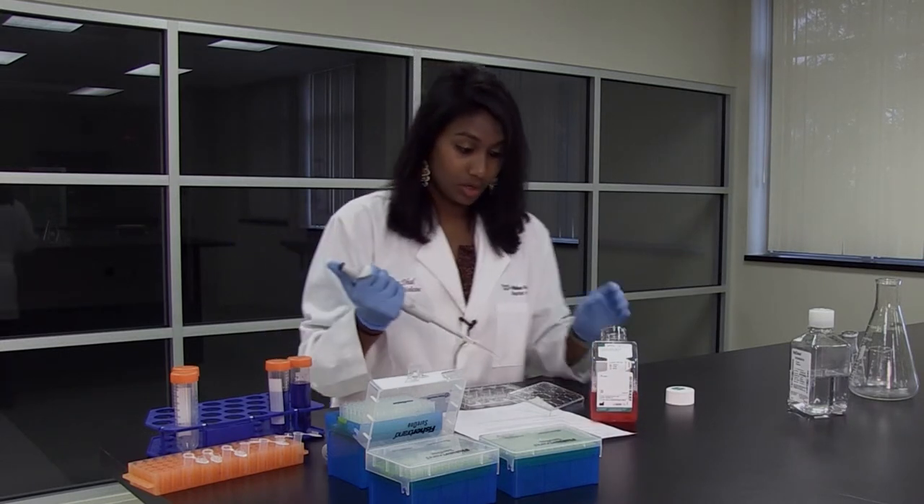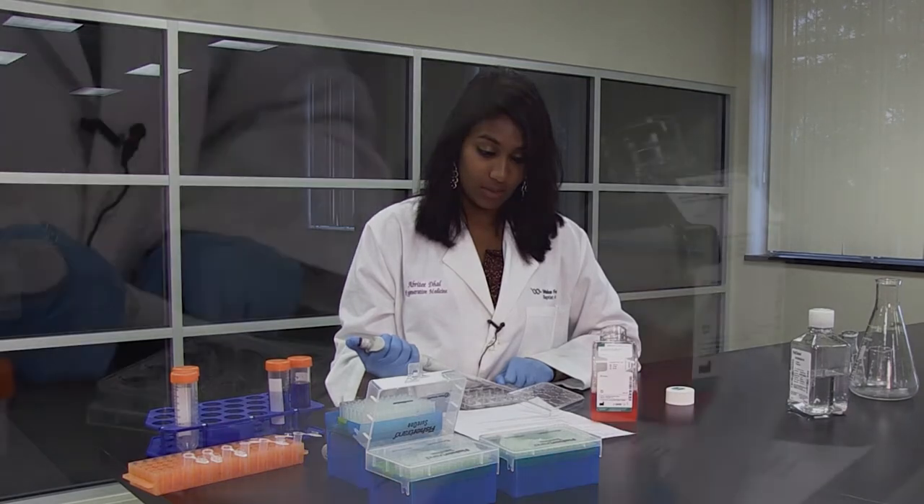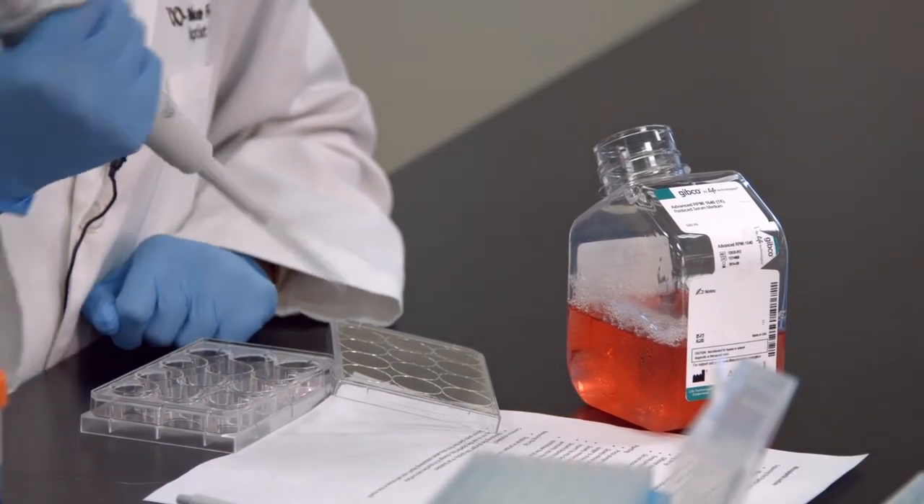To now release the liquid, we go down and press it until that full stop, and then there's another stop — a second stop essentially — and that gets rid of all your liquid.